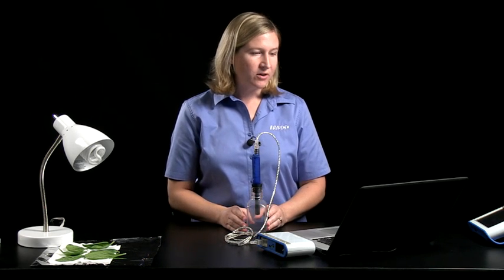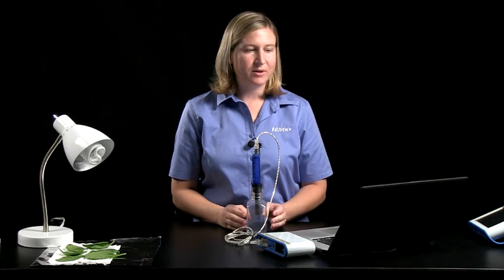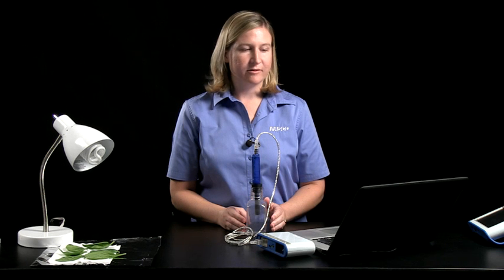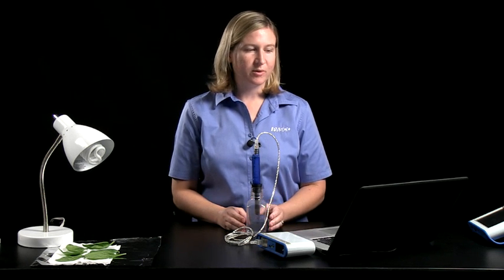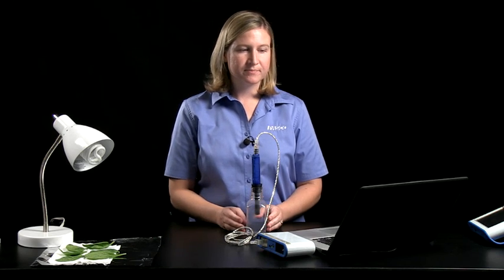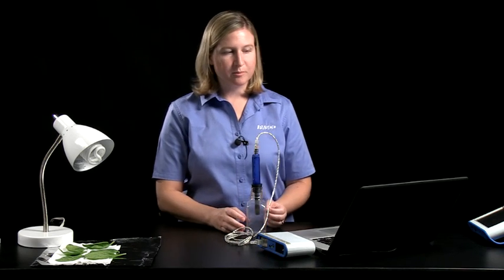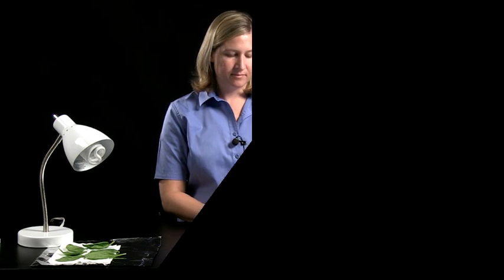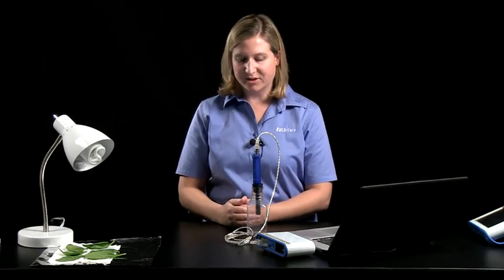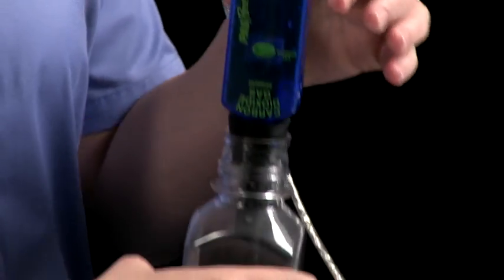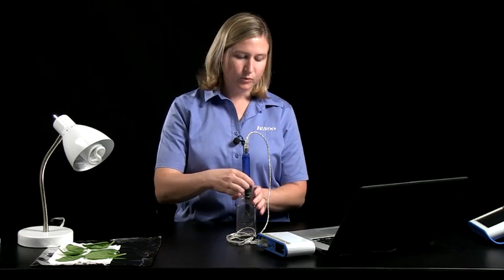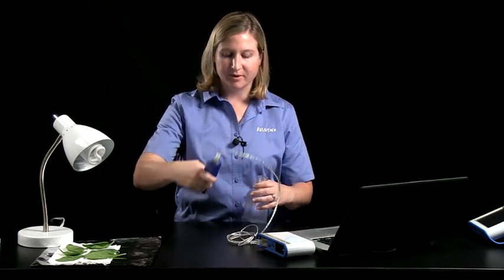I have this SparkView software open on the laptop computer, and the page will display the carbon dioxide concentration. It's not recording any data at this point, but it will display the carbon dioxide concentration for me. When calibration is complete, I'll see a number around 400 parts per million. Now that the calibration is complete, which I know from the light beginning to blink again, I'm going to remove the carbon dioxide sensor from my sampling bottle.